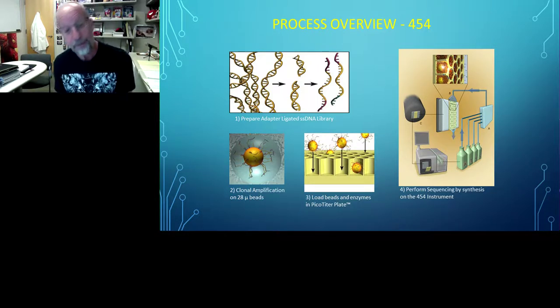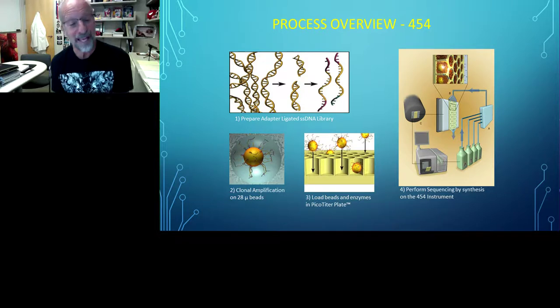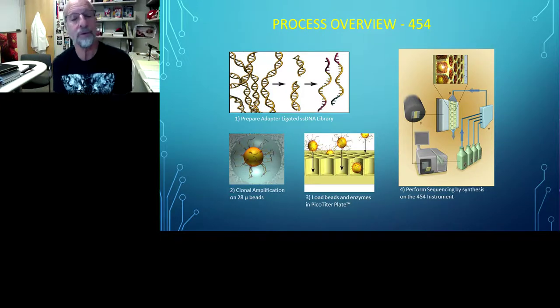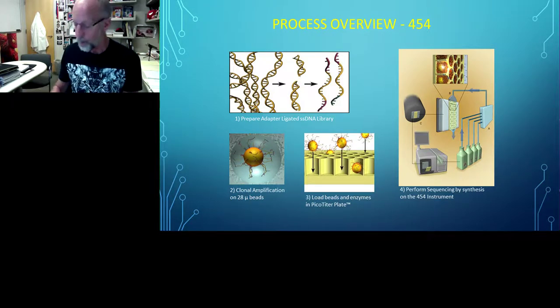And then on the right, this entire thing is set up in such a way that the beads themselves are now coated with the enzymes that are needed for pyrosequencing. Basically, what you then do is you flood the entire picotiter plate first with the A nucleotide, and you ask the question, is there an A incorporation in any of the wells, which will be seen as a flash of light because of the enzymes from pyrosequencing. You then follow it with the next nucleotide, one after the other.